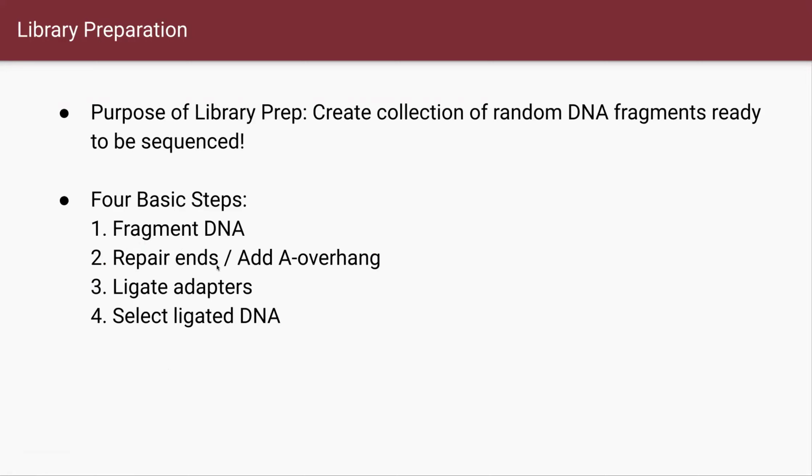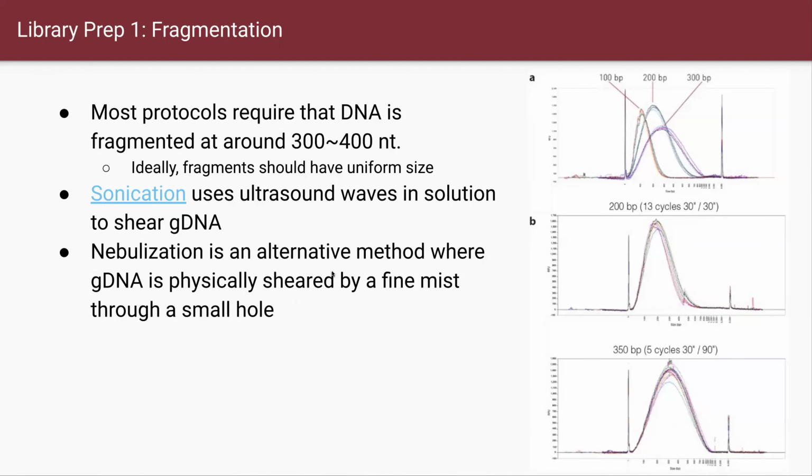Then you repair the ends, so it's ready for the adapter ligation. Then after adapter ligation, you do the DNA selection. So the first step is the fragmentation. How do we make DNA fragments out of the 3 billion DNA sequences?